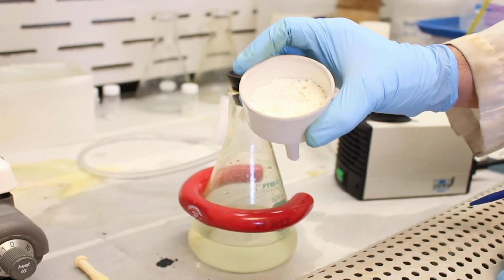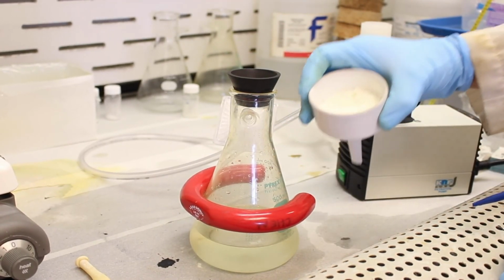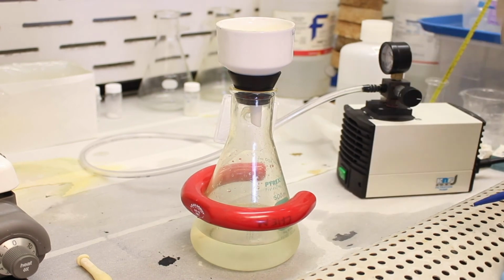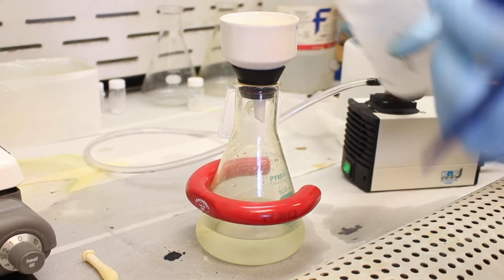But there is quite a bit of acid, so the filtrate here is extremely acidic, which also means that these solids probably still have some acid in them. So we need to wash them copiously with excess water to try to get as much of that acid out as possible. So, add water.